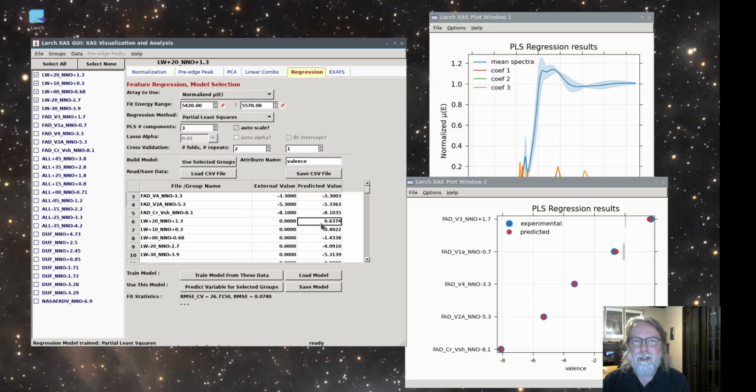The trends are right. And there's a difference that's maybe a systematic difference of about 1 or so of these log units of FO2, which is actually probably about the level of uncertainty that you can get from this technique. Certainly you can predict over a wide range, over several orders.